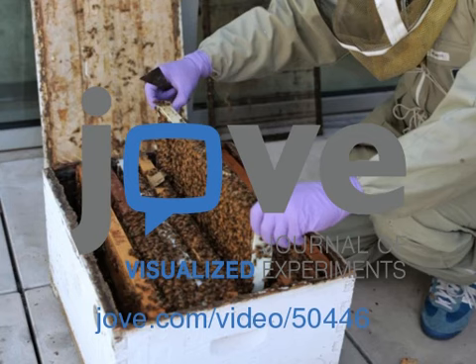The proboscis extension reflex, or PER, is a very useful technique for measuring gustatory perception, which is a behavioral predictor for honeybee social behavior. For example, nest bees with high gustatory perception behaviorally mature fast, forage early in life, and prefer to collect pollen.